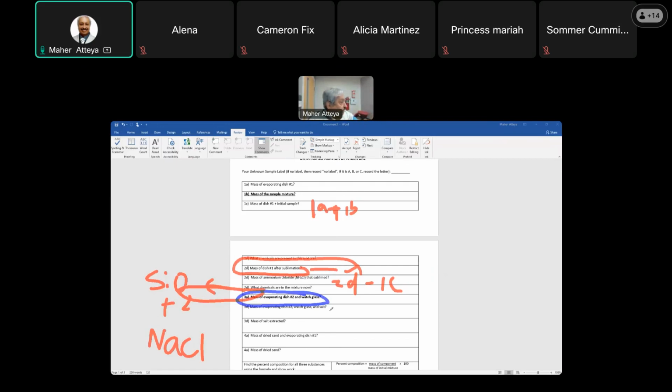What happens is we have the effect of popcorn, in the sense that when we heat, it will generate a lot of pressure, the vapor pressure of H2O, and it will start boiling, taking the crystals out. Popcorn effect: white sodium chloride crystals will start popping out. Therefore, the watch glass comes to prevent this popcorn effect. But you have to make sure that everything is dry. The watch glass should not be wet. Everything, including the crystals, will be dry.